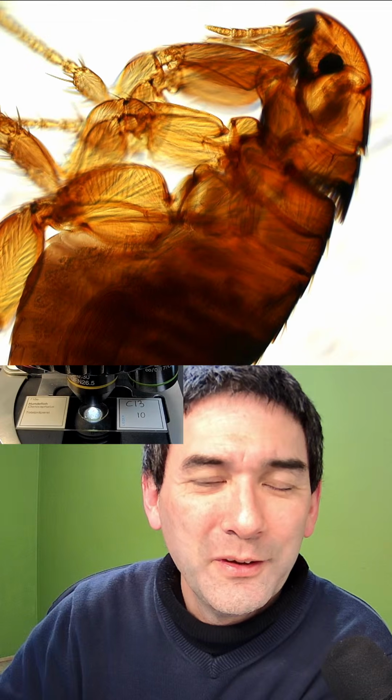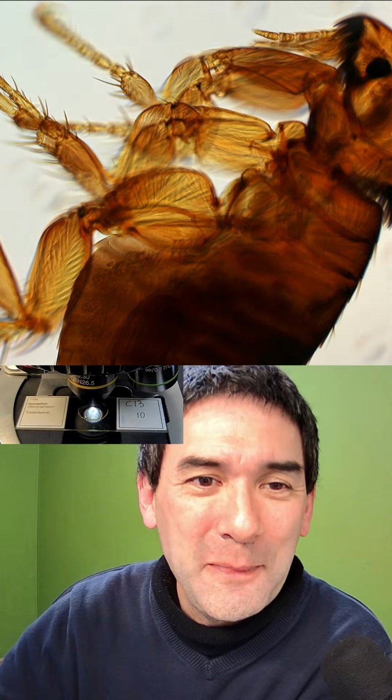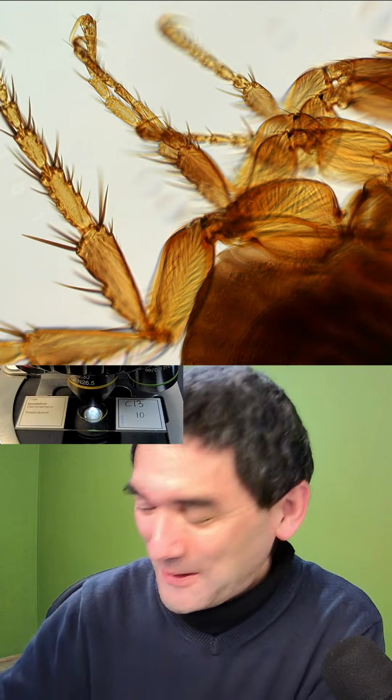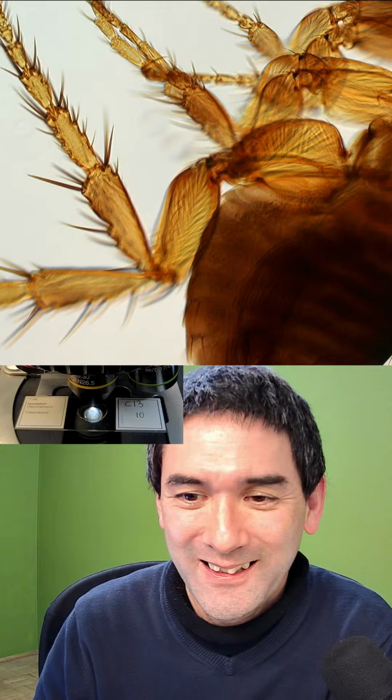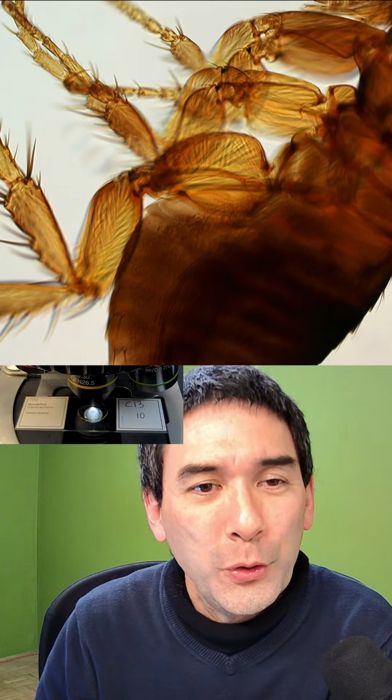And I said, of course you can use it. Later on, they actually sent me the file, and I was quite happy about that. And so that's the flea of a dog.